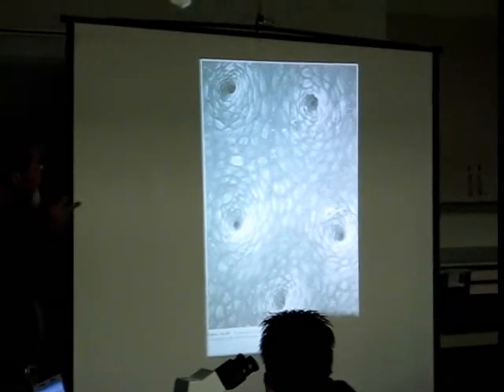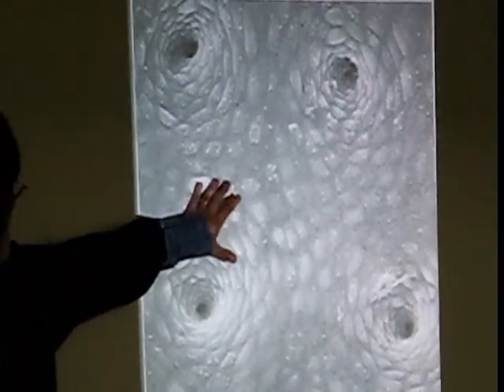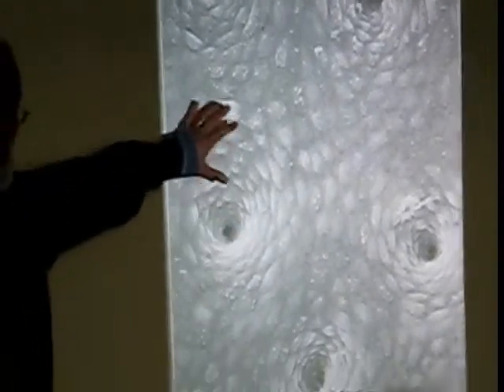Okay, this is a scanning electron micrograph, not colorized like the one Nigel showed you in lecture, but we're looking down onto the surface of the stomach. Okay? A lot of your sections had mucus covering this, right? An eosinophilic thing. Some of it had extravasated red blood cells and other stuff in it. That's been removed here, so we're looking down.